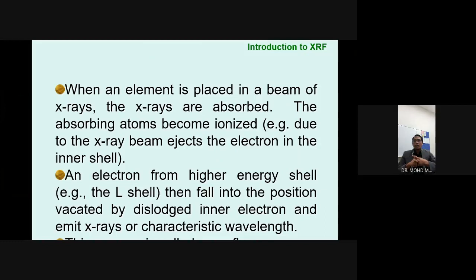So, you as a material scientist in training will be able to explain the principle of XRF, how the machine works, and how the instrument will be able to tell us about the characteristics of the materials. In this case, the components or elements of a material can be revealed from the X-ray analysis, which we will refer to as the XRF spectrum.